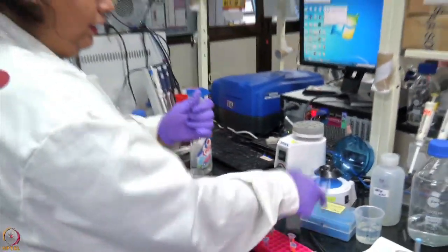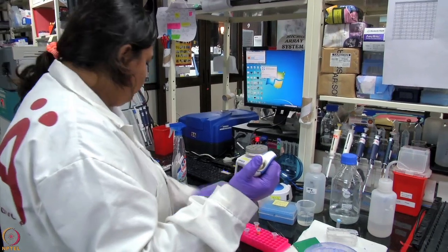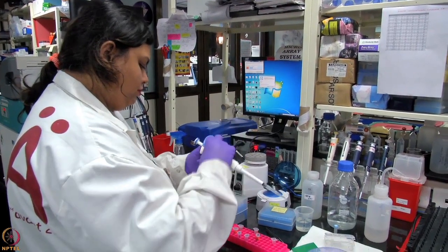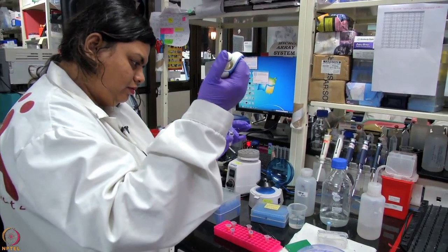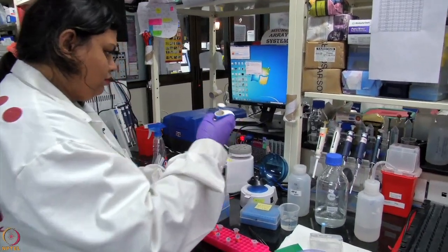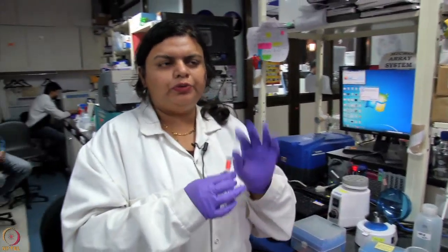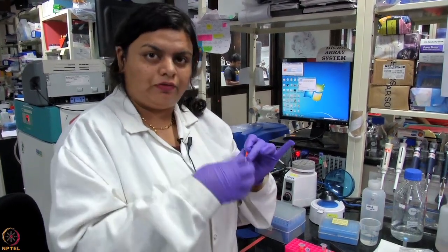So now that your beads are activated, you can get rid of the wash buffer. Put some fresh wash buffer. And in this you can now add the antibody. Usually 2 to 5 microgram of antibody is used, but it depends on the protein of interest and how specific your antibody is.